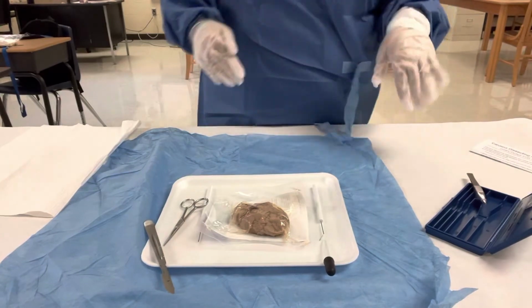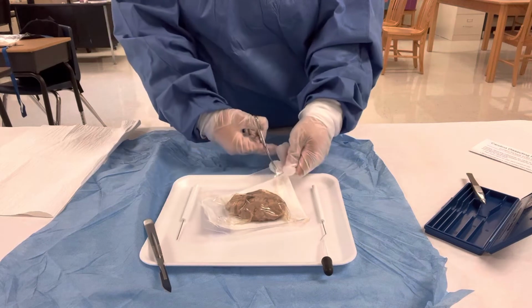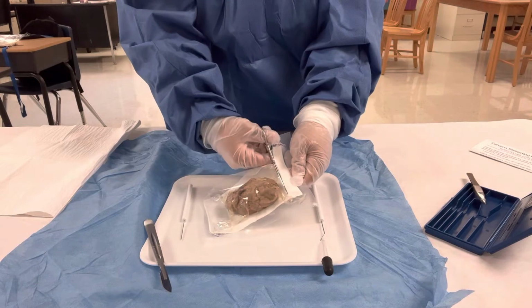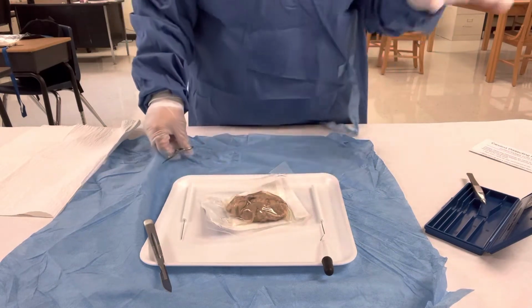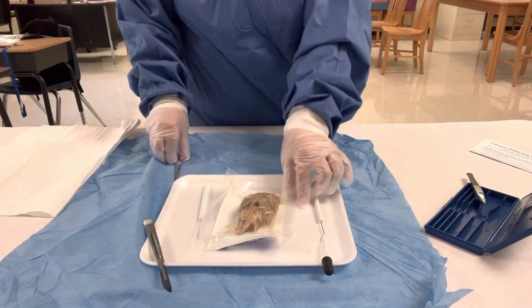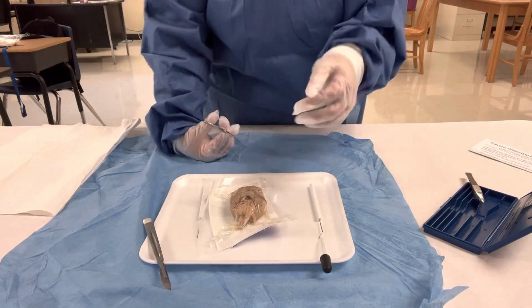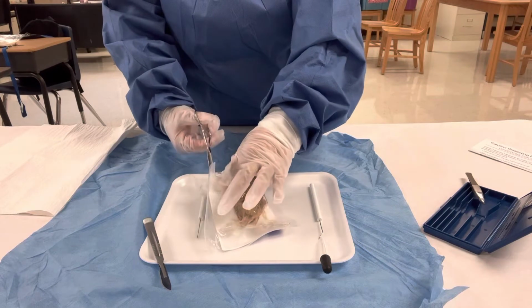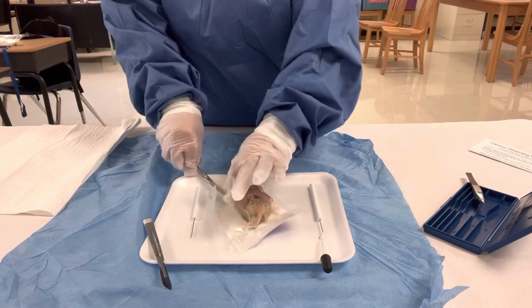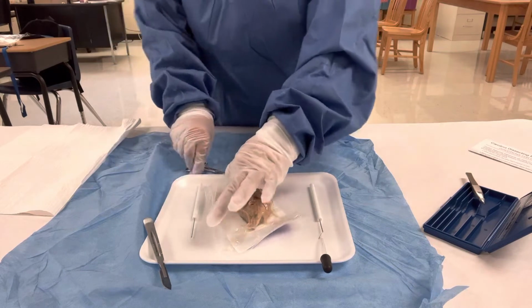Jesus, be with me. Lord have mercy. Oh, Jesus. Okay. Ew, it's bubbly. This is so gross. Ugh. Oh my gosh, Drea. I'm not flicking nothing. I'm taking my phone. Juice falling over. No, yeah.